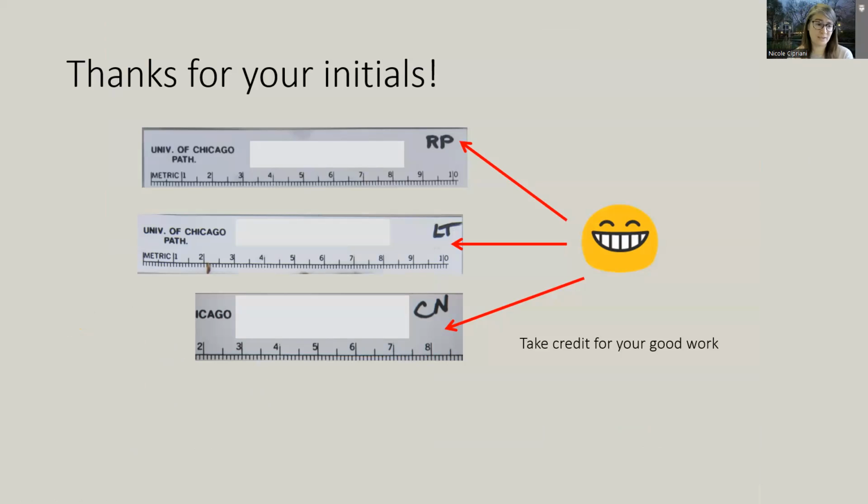We do ask our residents and our PAs to put their initials on the photograph so we know who took it. So if we need to go back and ask questions, we can. I don't know what your protocol is, but some people remember, some people don't.